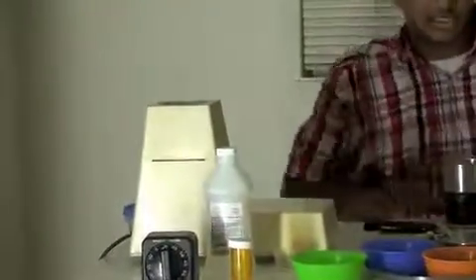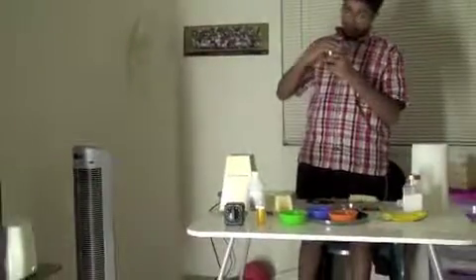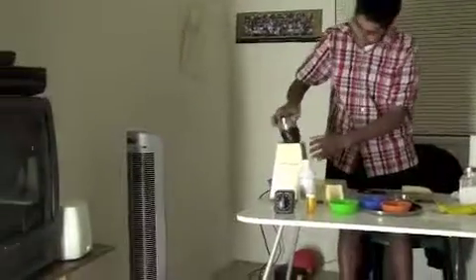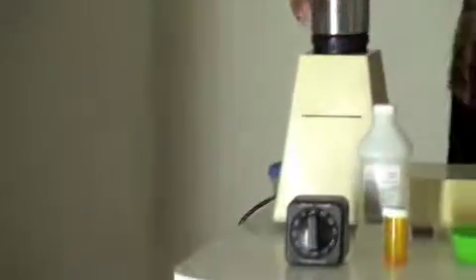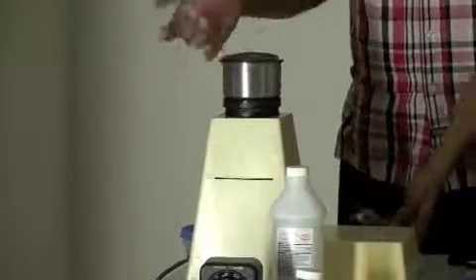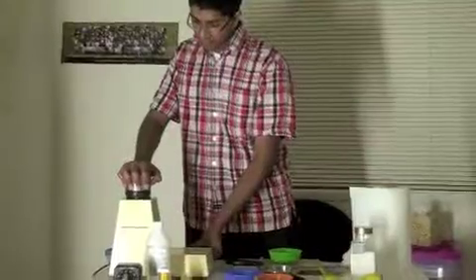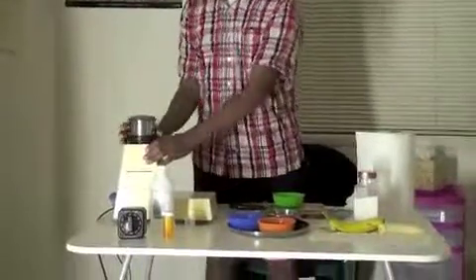Now, if you need help with this, sure, go ahead. Ask your parents. But it's fine to do this step alone. When you get to later parts, you might need some parent assistance. So, lock this in tight. You want your DNA samples to be intact. And blend it for about 15 seconds, like Aditya said. You want a smooth texture instead of a chunky texture for this.